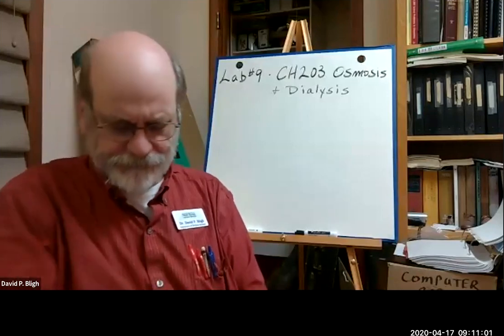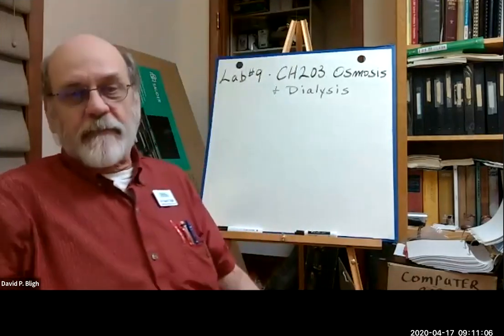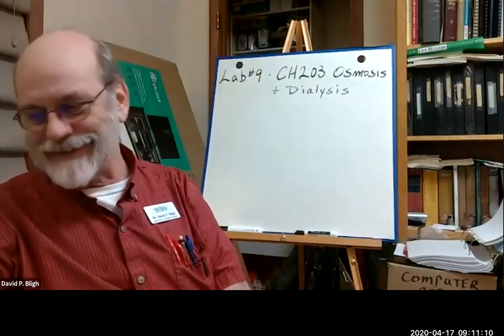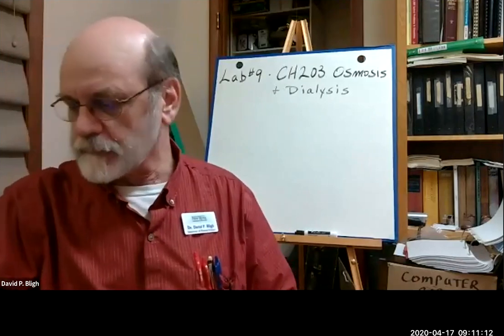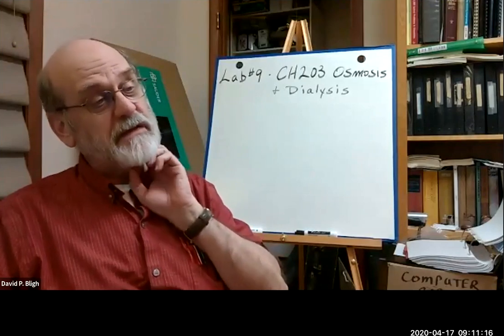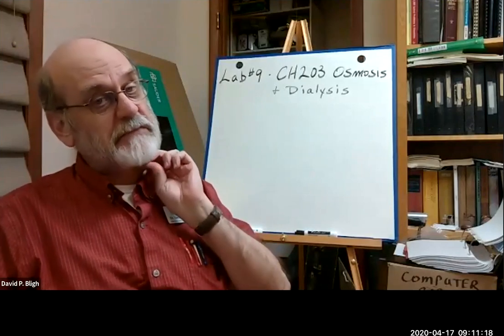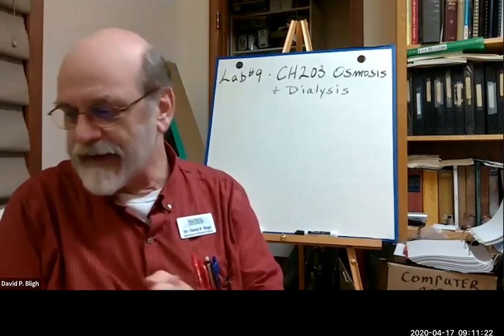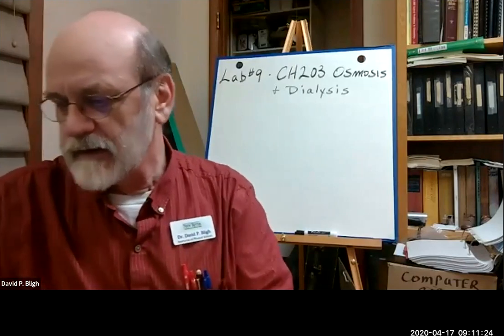So here we are, Chem 203, lab number 9, osmosis and dialysis. Osmosis and dialysis might seem like different things, but they're really closely related. And we're going to find out how they're related in the process of performing this lab.